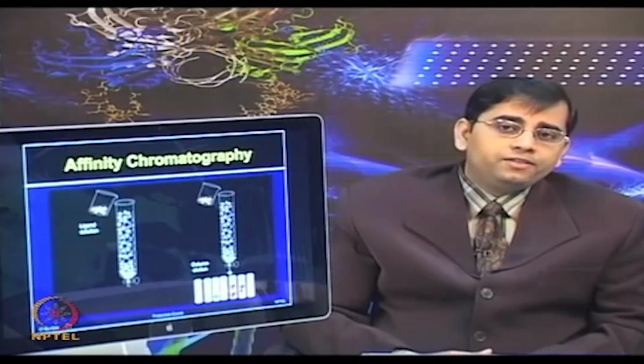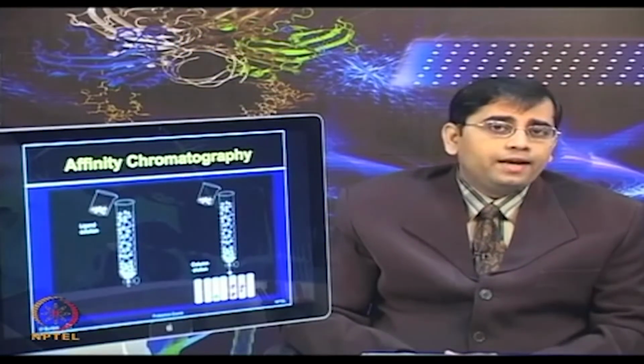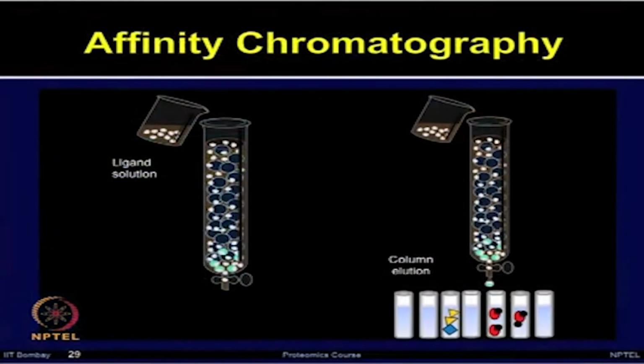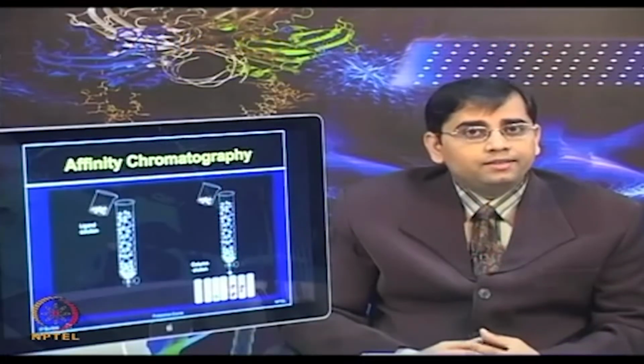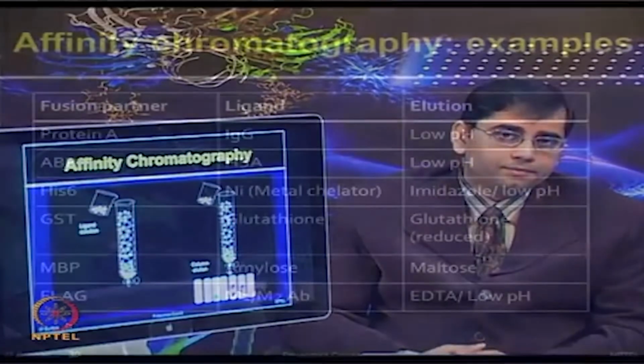Due to the specific interaction, affinity chromatography achieves a very high degree of protein purification. It is not limited by the sample volume, as is the case with gel filtration chromatography, and because of its superiority in achieving pure protein, it is usually considered the final step for protein purification.